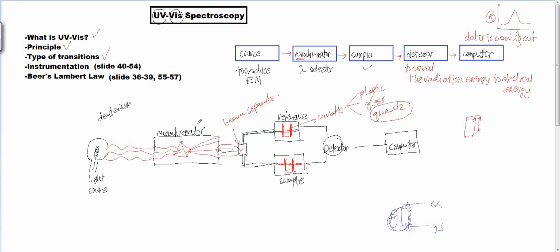So that means the original intensity from the light source tetap sama. Betul? Contoh kat sini, if we take it in percentage, 100% of the light source going through, so 100% akan keluar. Why? Because there is no absorption. So dekat sini kita panggil I naught, the original intensity. Sebab itulah kita perlu letak reference, so that we know there is no absorption, and we know the intensity is similar to the one supplied by the light source. Okay, so I hope that you understand.